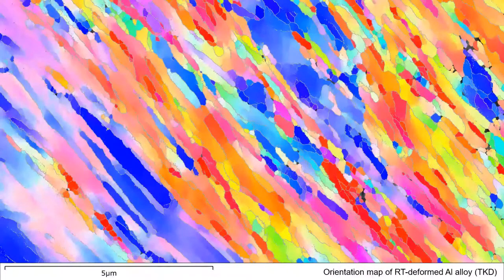Here we're actually looking in transmission, so we can actually do EBSD in transmission. We call this transmission Kikuchi diffraction, but it's essentially all the same detector hardware. It's just a special holder that you can put a TEM grid or sample in, and then that mounts it above the phosphor screen so that the beam can strike the sample, which can be at 0 tilt, and then we collect the emerging diffracted electrons on the underside that fall on the phosphor screen. We have a special indexing algorithm that corrects for the distortion in the patterns and correctly detects the band centers and gives, as you can see here, a very high quality result.